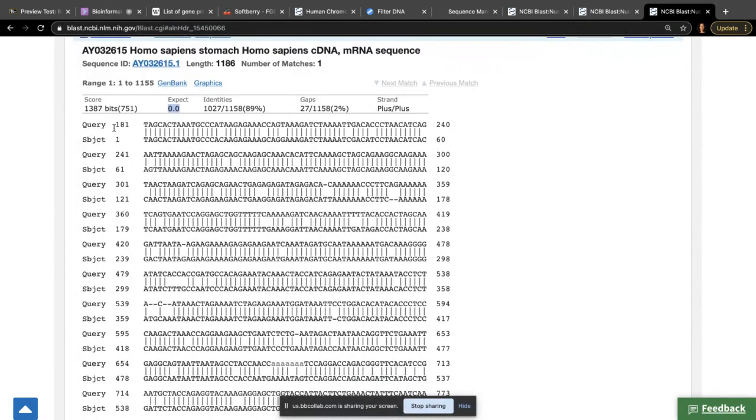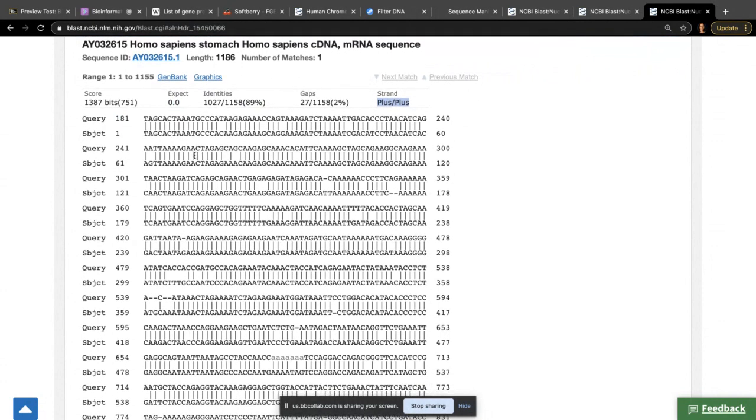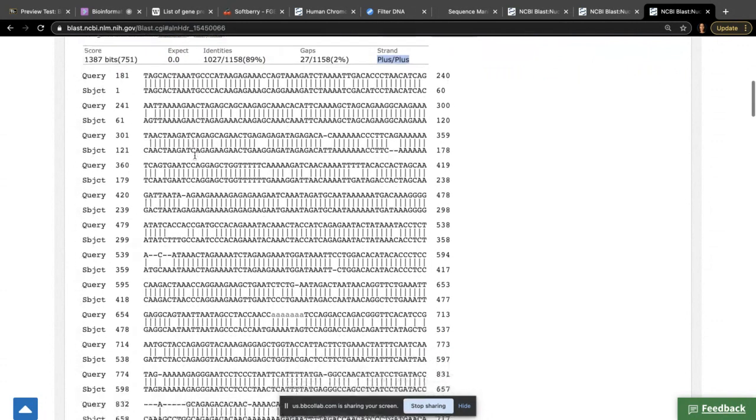So let's see. It looks like from the sequence that I entered, nucleotide 181 has a start of a gene. So that's plus plus. Okay, so the gene predictor didn't see that one. I think the first gene they predicted was in the 500, right? If I remember right. So this is not corroborating the prediction. This is predicting something the other approach didn't predict. So for my PhD, when I was annotating strawberry, I was using both approaches and seeing where they agree, where they do not agree.